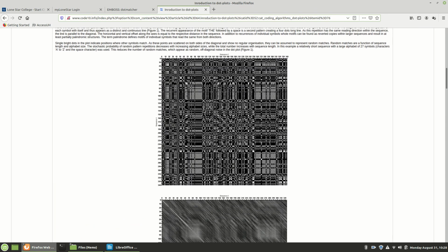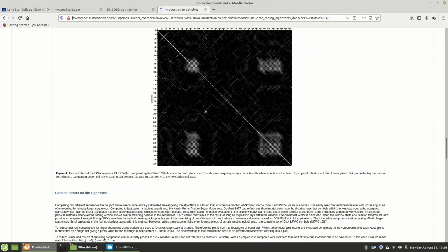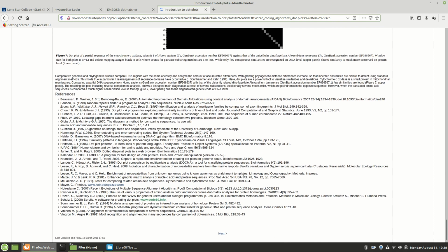I don't want these. These don't tell you much. That's too much. You need to get something like these. Let's see, anything else? This is common. This means you don't have much of anything. This might be something you might see, something very similar to that. All right, that's kind of what I'm looking for.